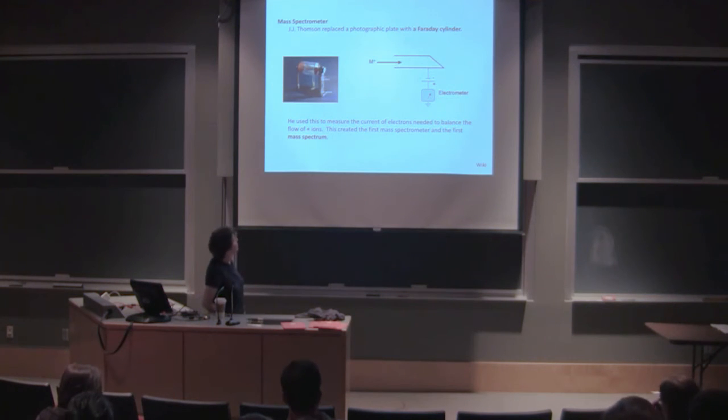This is an illustration of the circuitry of a Faraday collector. I just want to say a couple of things about how we handle signal processing slightly differently in these instruments. There's these, of course, JJ Thompson. Love this guy. So in his early instruments, he developed initial mass spectrometry using photographic plates and then later replaced them with a Faraday cup, which we now use today, moving us from mass spectroscopy to mass spectrometry. Isn't that cool? So cool. Anyway, so the Faraday cup collects the ions that come in, and a current is fed to that cup to neutralize the positive ions. So you have electrons kind of coming in to match in quantity the number of positive ions hitting your cup. And you just measure the flow of electrons, which is otherwise known as a current. So you're just measuring that as your, and that's actually what gives you your isotope analysis.